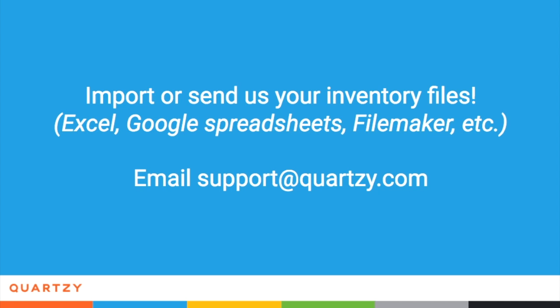There are two great ways to get started with the inventory module. If you already have an inventory list, you can send it to us or use our template to import it. If you don't, no problem. Start using the request module and your inventory will be populated over time.